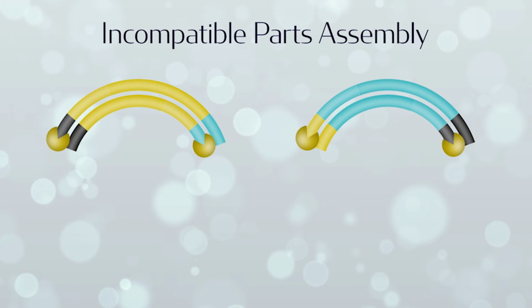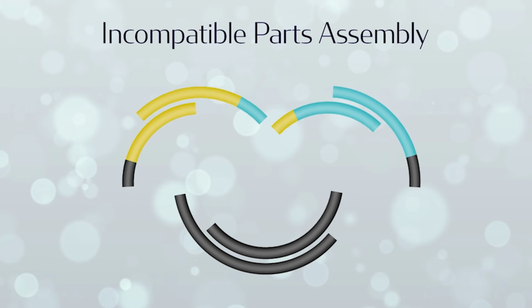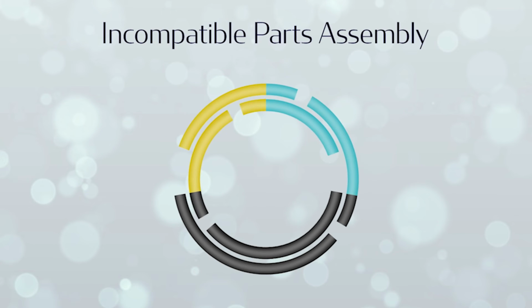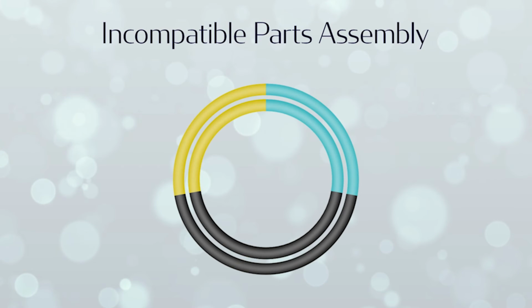Due to the continuous activity of the 5' exonuclease in the single isothermal step, the 5' end of the now double-stranded oligo is degraded as well, resulting in annealing of the Golden Gate parts. DNA polymerase again fills the gaps, and DNA ligase will seal the nicks. The result is the desired Golden Gate parts merged in the backbone.